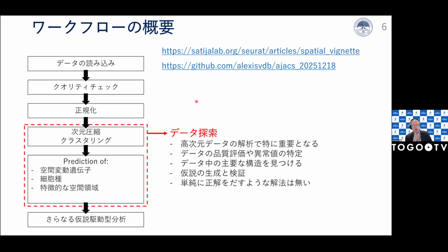And so I will use that as a basis, but I also put the code that I will show on GitHub. You should be able to access it here. And I limited the code to just the really essential commands. So I removed things that are not really necessary. I hope it's easy to understand.